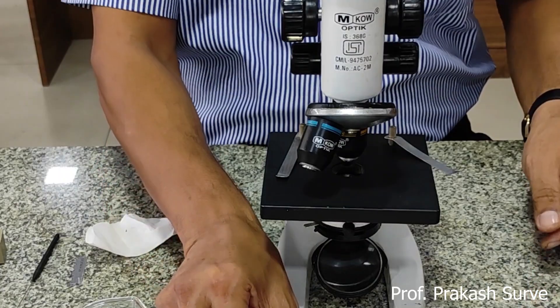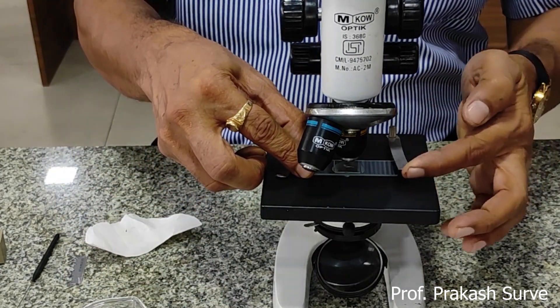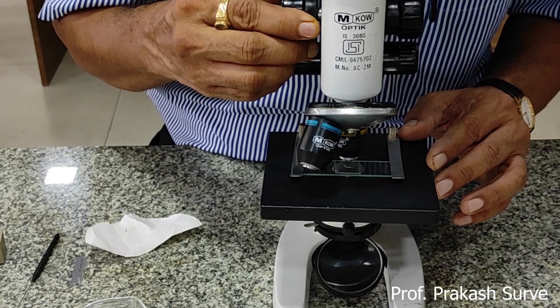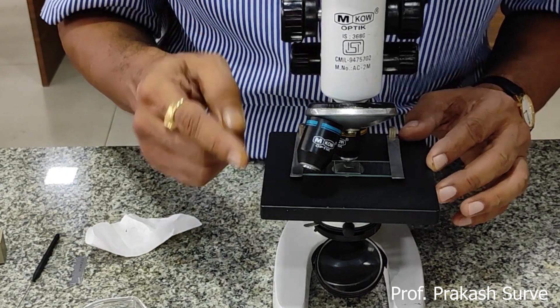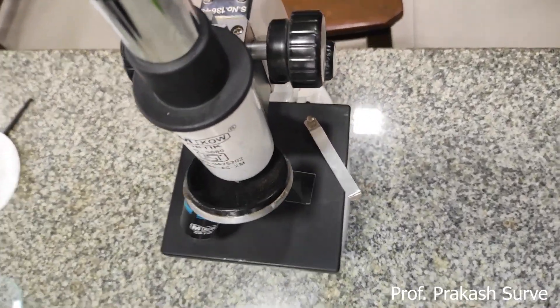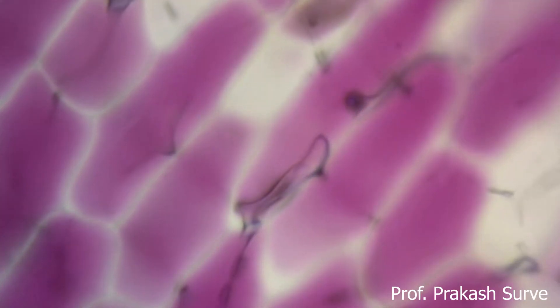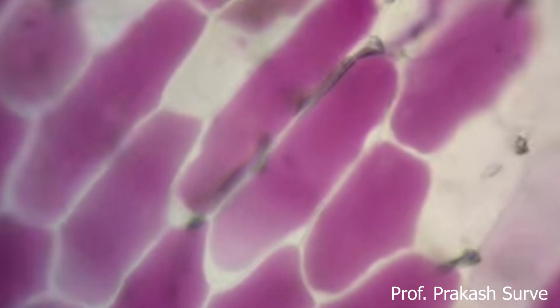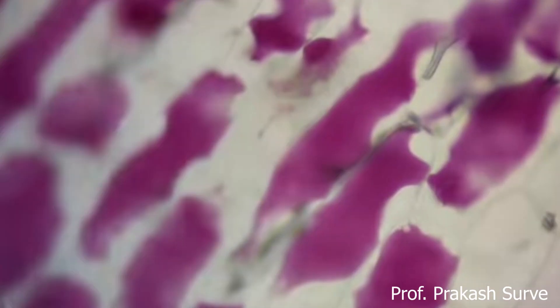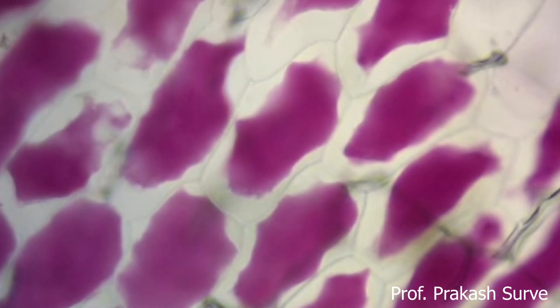This slide is again kept under the 10x objective of the compound microscope. Fix the approximate position, get a rough idea, and adjust the source of light through the concave mirror. Now we can get a clear idea of how plasmolysis has taken place. All the protoplasm — the colored sap — starts shrinking because it is kept under the hypertonic solution. The whole colored sap is plasmolyzed and we can easily observe this.